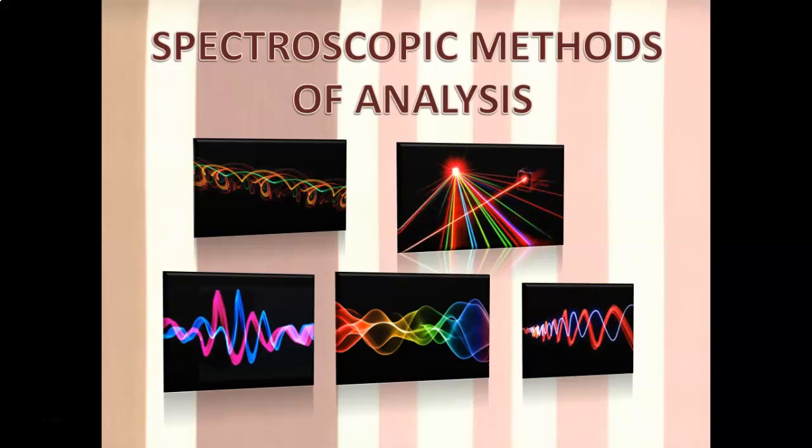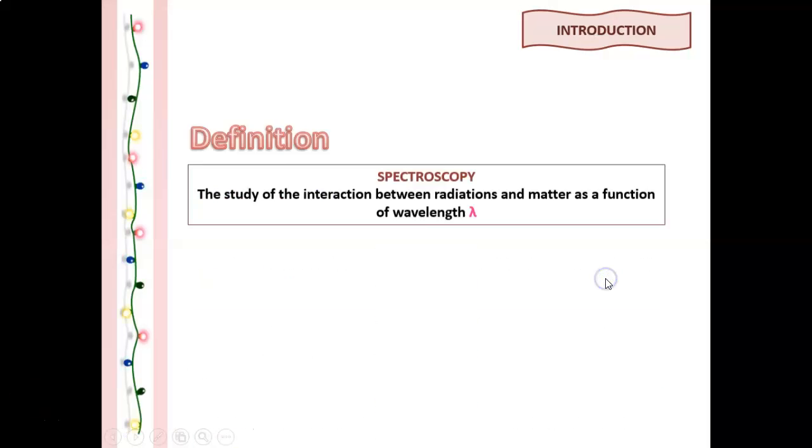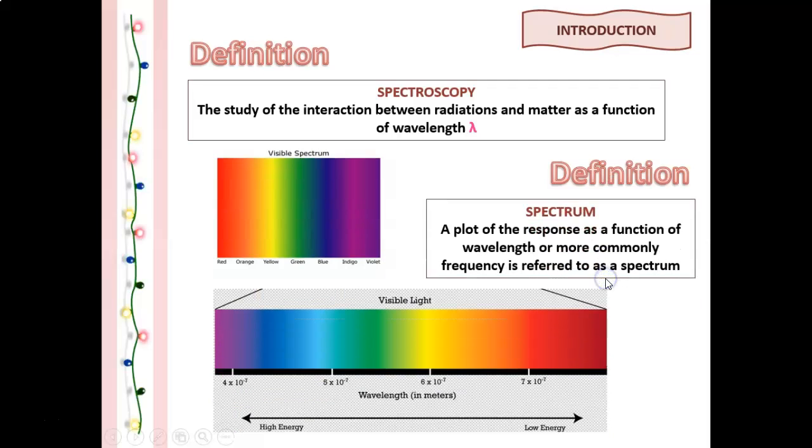Okay, today's lecture I'm going to cover chapter 4 in our syllabus, which is spectroscopic method of analysis, and in chapters 5, 6, 7 and 8 you will learn about all the instruments. Now we look at the first slide, the definition of spectroscopy.